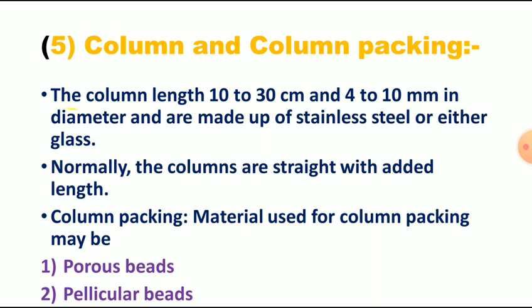The column length is about 10 to 30 centimeters and 4 to 10 millimeters in diameter, and it is made of stainless steel or glass.